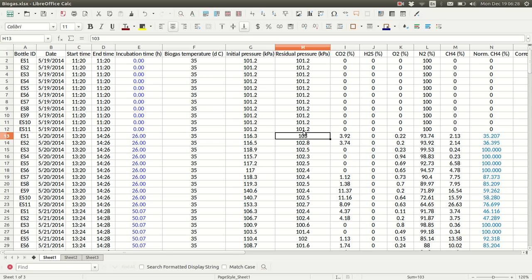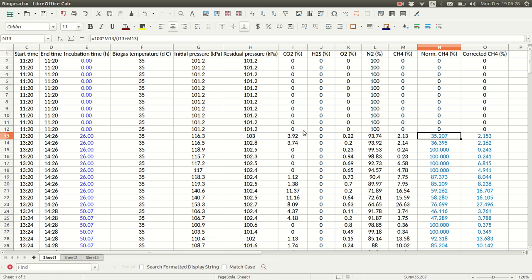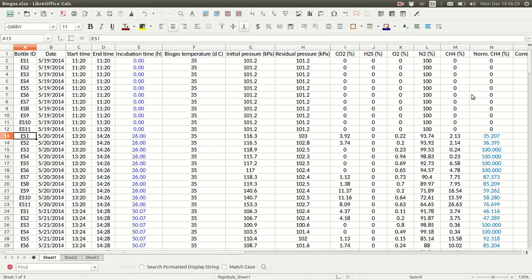And then in this file, we have biogas composition as well, and we're most interested in methane. Often, methane concentration is normalized, so the sum of methane and CO2 is 100%, but we have additional data on biogas composition here, so we're going to use non-normalized values that are corrected for a little bit of air that got in at some point in the sampling process.